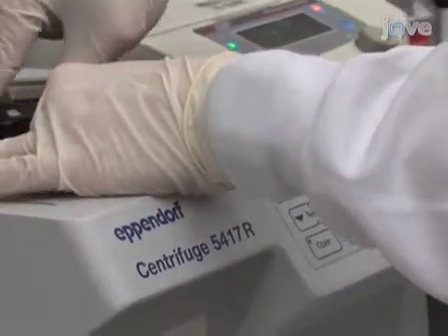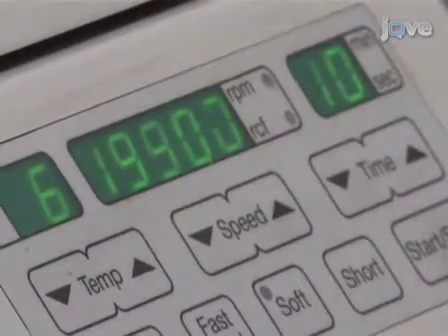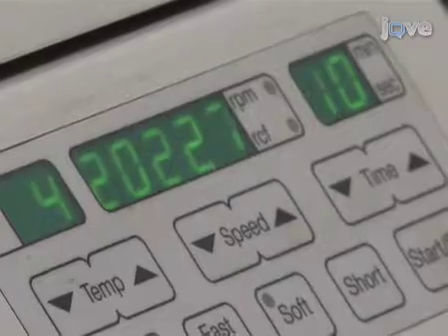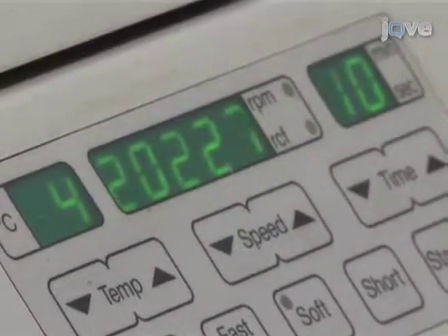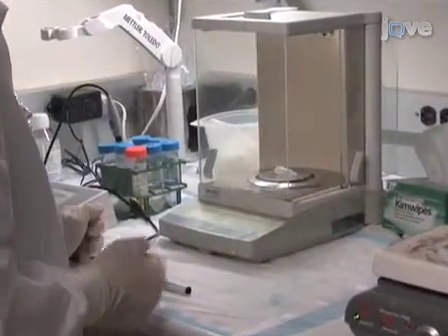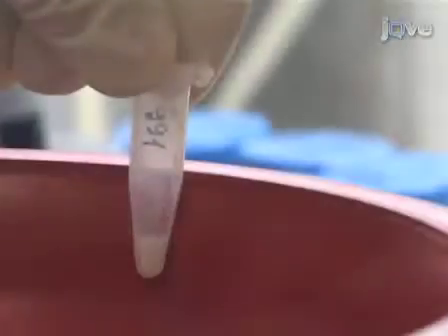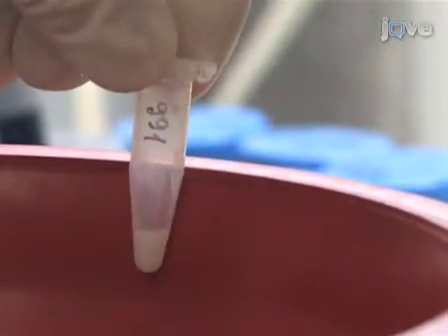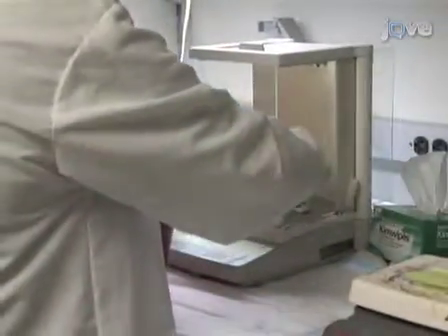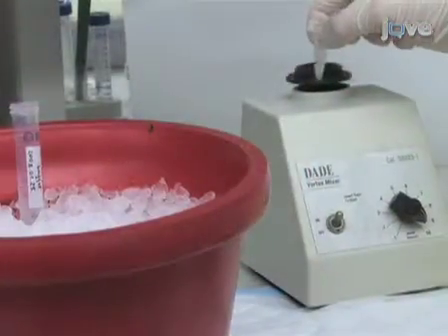Once the cells are homogenized, centrifuge them at 20,000 times G for 10 minutes at 4 degrees C. This will give us a crude mitochondrial pellet, which will also contain nuclei and larger cell fragments. Before collection of the pellet, we have to weigh the collection tube in order to estimate the subsequent pellet weight. Pour out and discard the supernatant, and then weigh the precipitated crude mitochondrial pellet by subtracting the weight of the tube. One can then proceed to solubilizing the pellet.